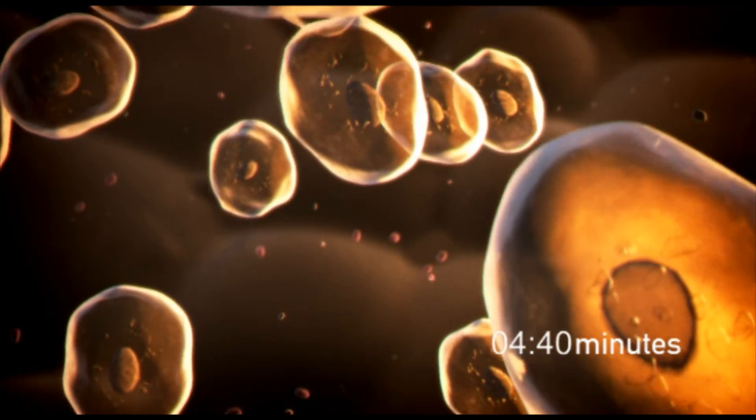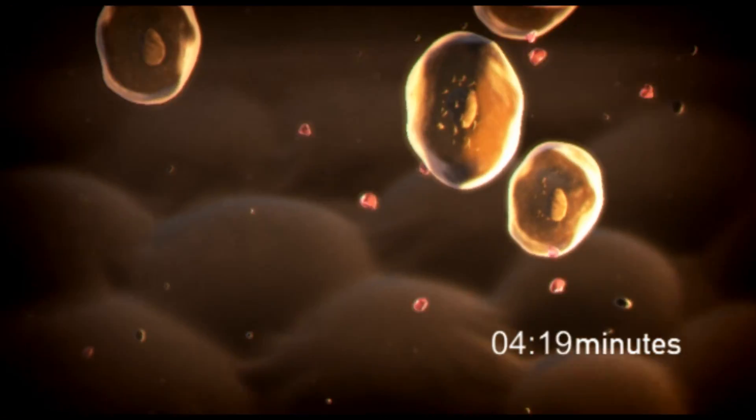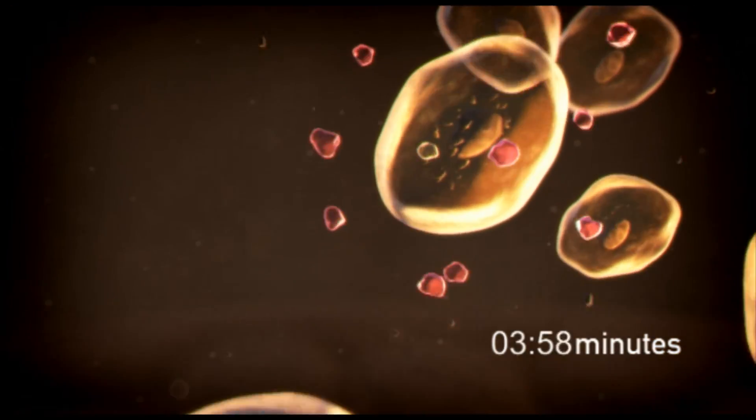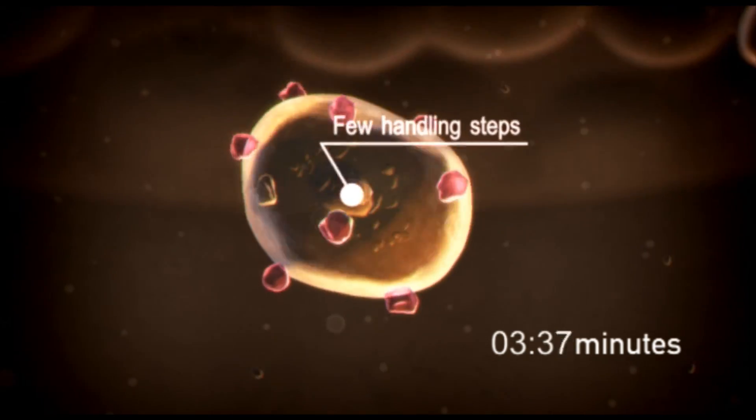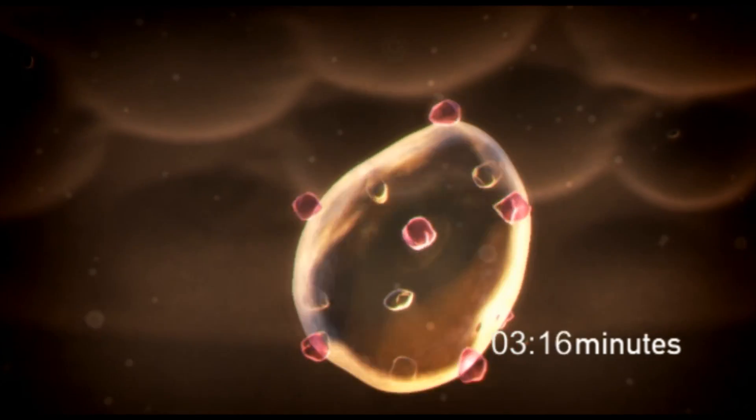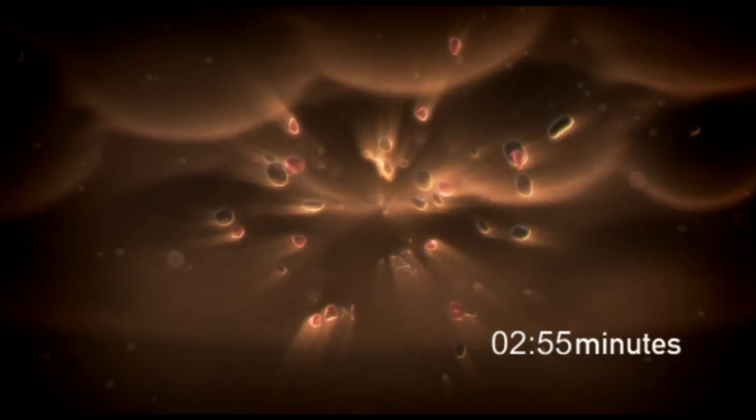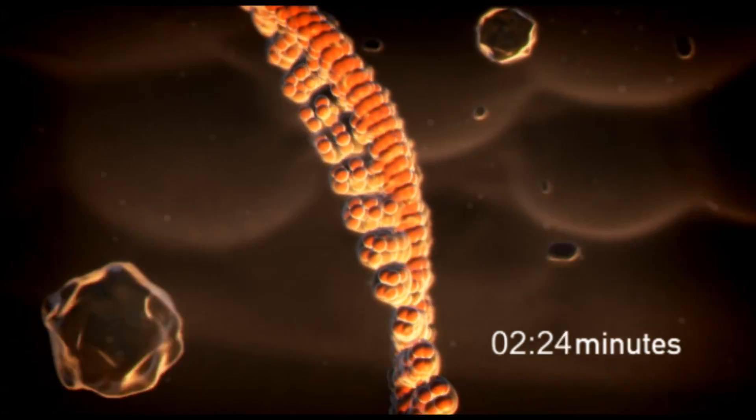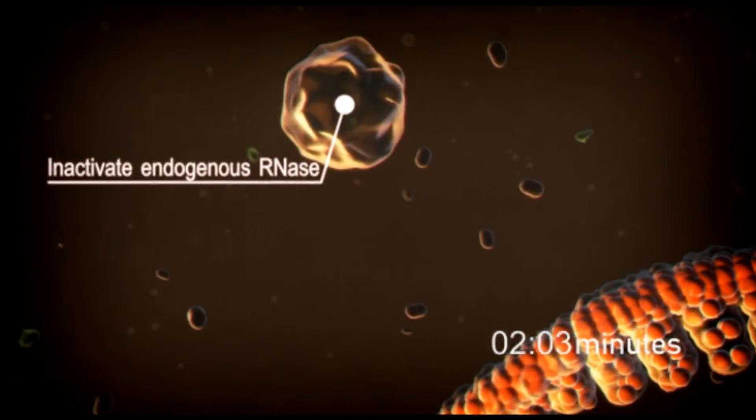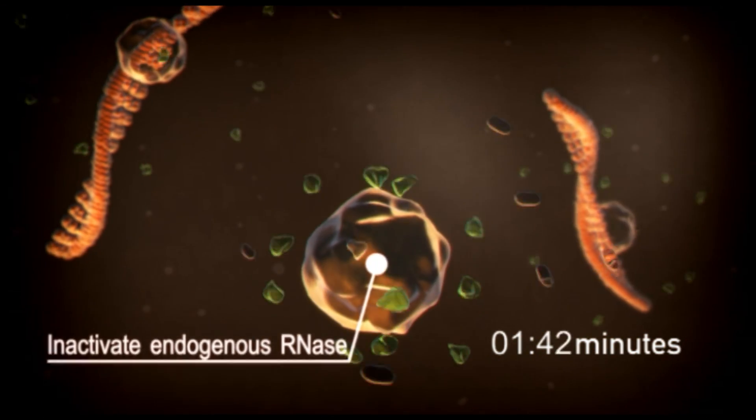The Ambion cells to CT kit also reduces the risk of contamination and loss of sample since there are few steps in which the sample is pipetted. Cells are lysed during this incubation, and RNA is released into the lysis solution, which also contains reagents to inactivate endogenous RNases.